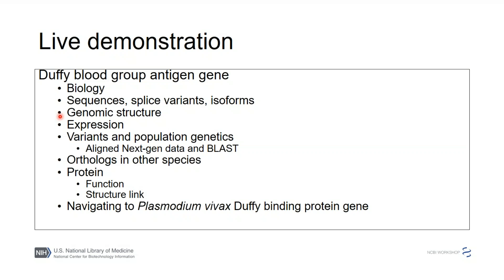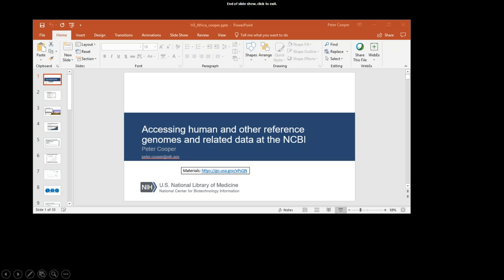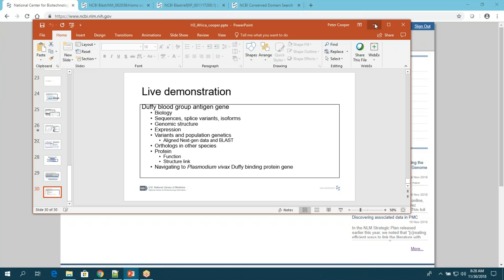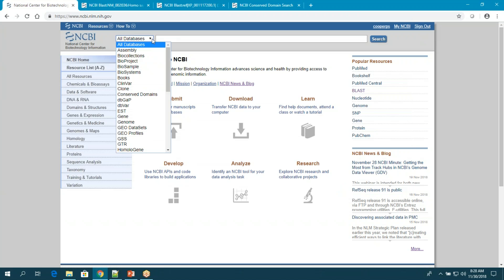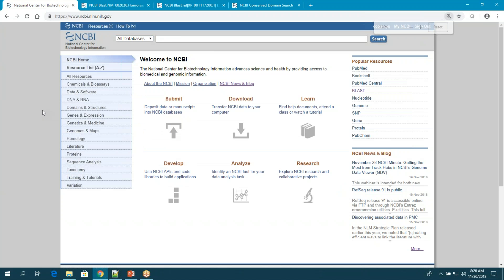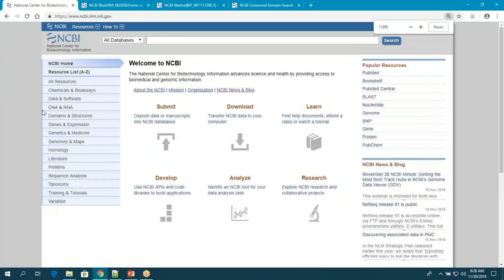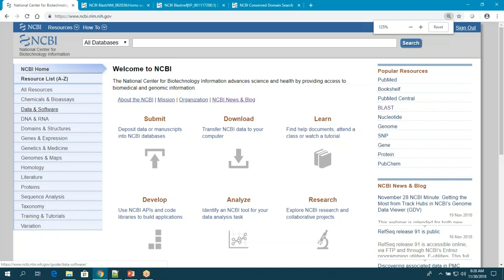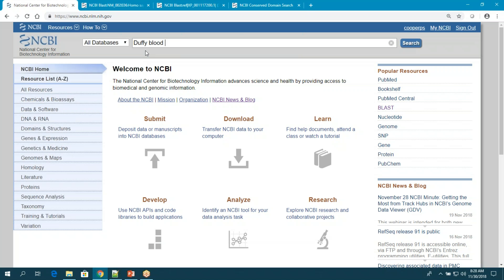I'm switching over to the web browser now. This is our homepage — you can find it easily by Googling NCBI. I'll search for 'Duffy blood group' and pick the Gene database from the results.